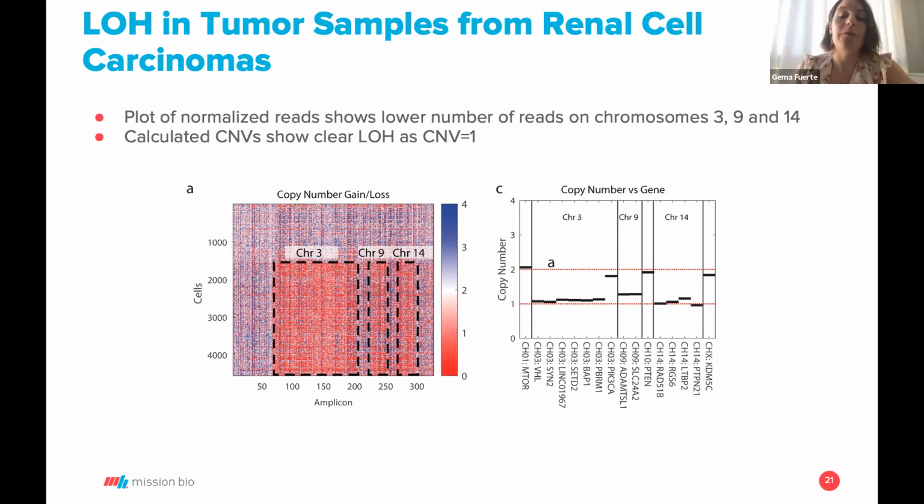I know not everybody wants to use a spike-in solution, but if it is 100% tumor, which is not often the case, that would be something that you could try: spiking in a normal cell line or normal population, just to do the normalization. Great, thank you. Good, perfect.